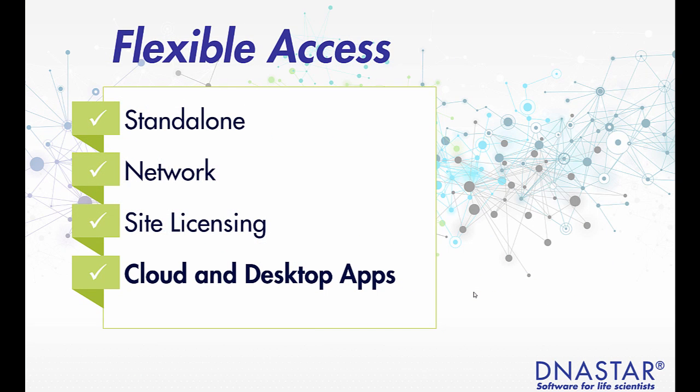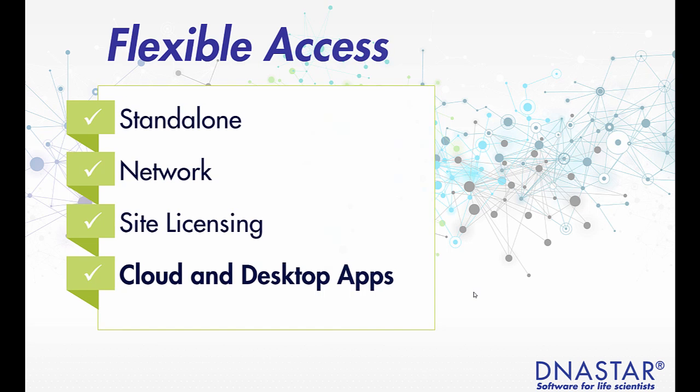All of this software is available in a variety of licensing options to best meet your organization's needs. All of the software is available on a desktop computer, which is our traditional method of delivering the software, what most of our users use. But we also have cloud options for all of our applications. So if you want to use a virtual machine for your analysis, you can do that as well. And that's where we'll be focusing our attention today.